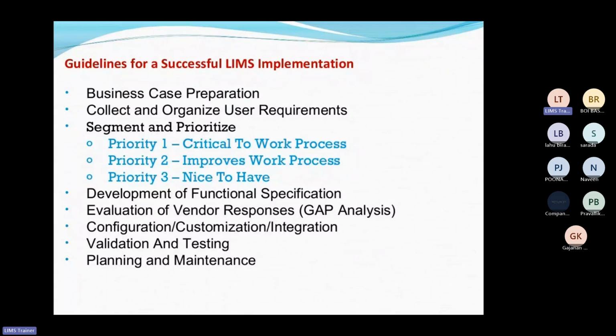And who is going to explain those user requirements to the IT persons? IT persons have no knowledge about the laboratory. They don't understand how that particular laboratory works, what their requirements are, what the regulatory requirements are, how they want the printouts of their reports, or how they change work allocation from one analyst to another. This is not the knowledge of an IT person. This knowledge is with the end user who has pharma experience. Got my point? So if that person also has overall LIMS knowledge, which is covered in the course, that will be a great benefit for that candidate to succeed in the interviews. Is that clear? Yes, sir.